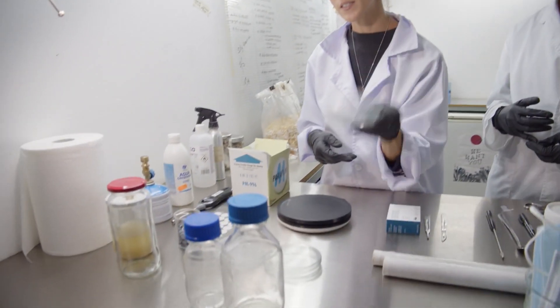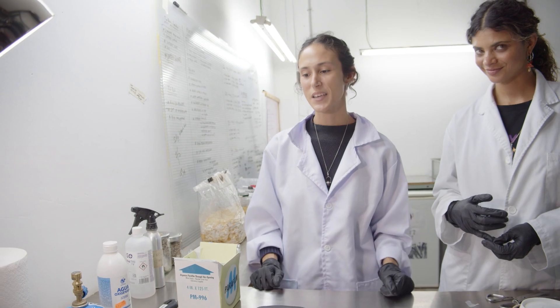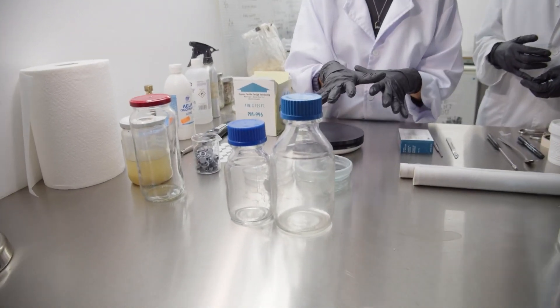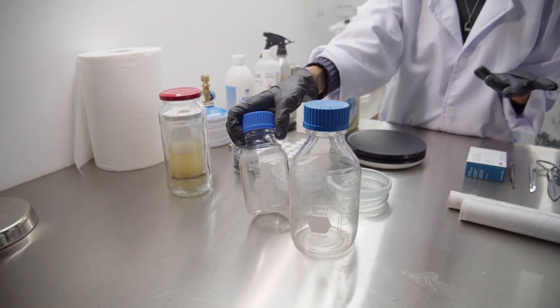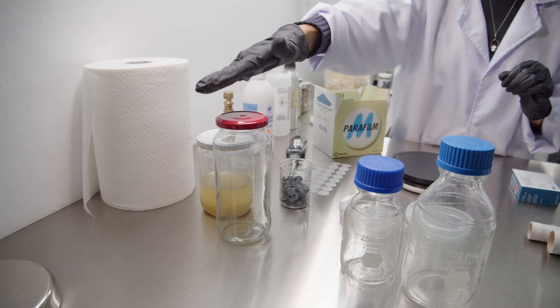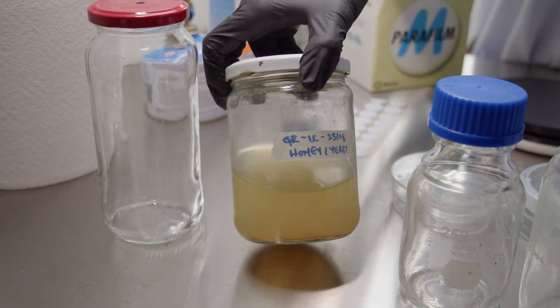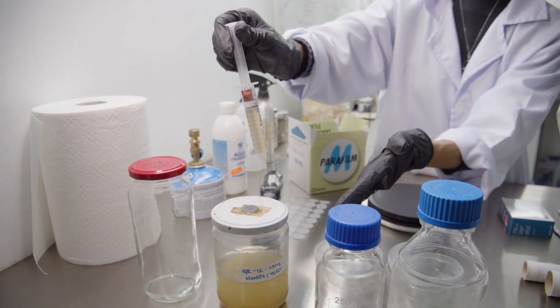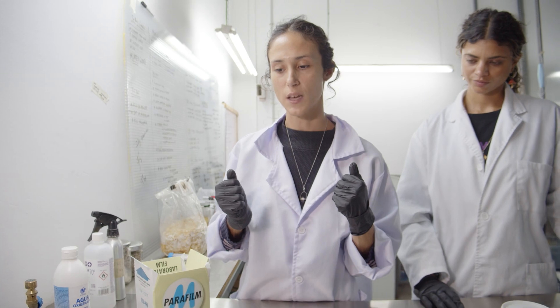Glass petri dishes are autoclaveable, meaning you can re-sterilize and reuse them an infinite number of times. We also have measuring flasks, used to make anything from liquid cultures to liquid agar medium before pouring onto plates. Recycled jars or mason jars are used to expand liquid cultures — we buy liquid cultures in syringes and use jars to expand and make more of that liquid medium to keep reusing and create new genetics.